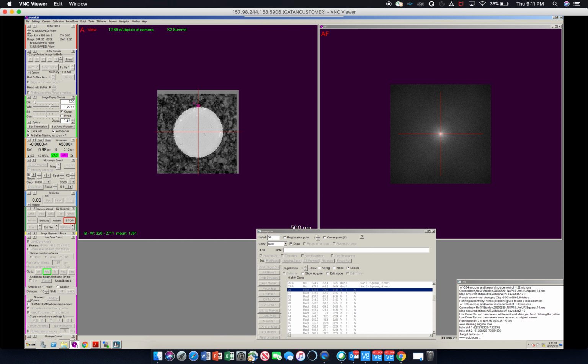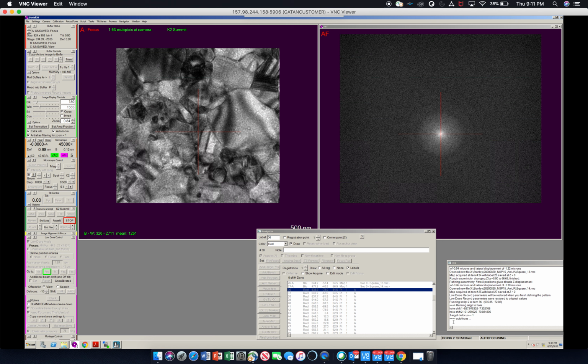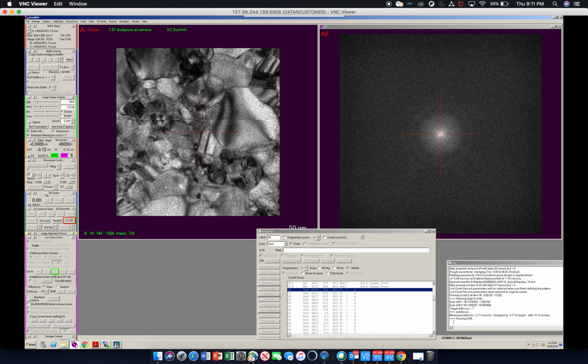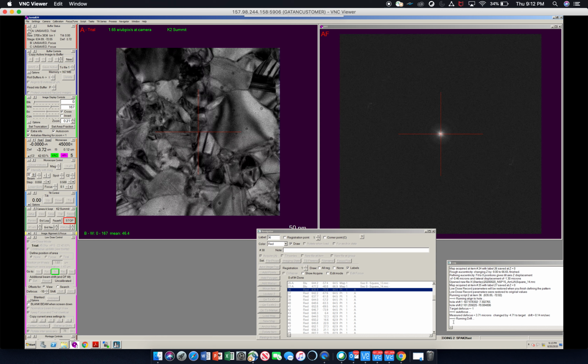And if you follow your log window here on the side, you can see that it's now starting to autofocus. And at the very beginning, you have to wait for the drift to die down, and sometimes that can take a minute. So now it's running drift, and it will give you a readout, and it will begin collection as soon as it gets below the threshold that we've set, which was 0.5 angstroms per second, or 0.5 nanometers per second, my mistake.